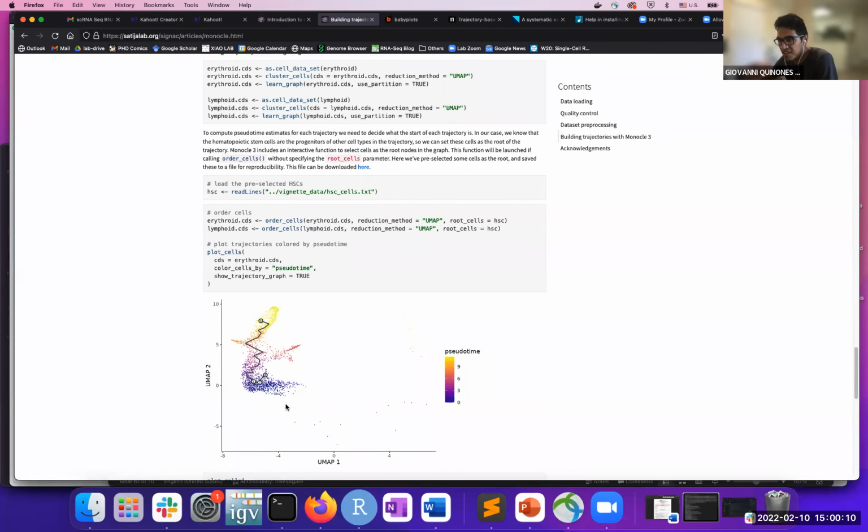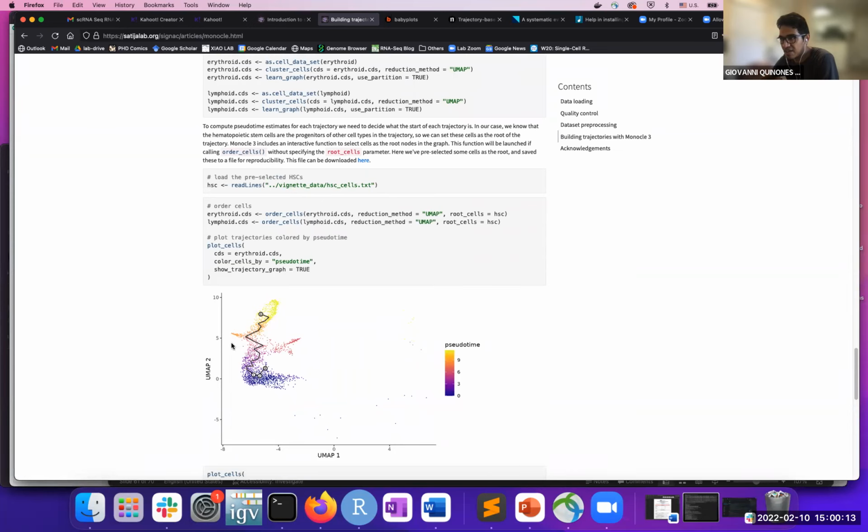In this plot over here, you can see that they're showing the representation in the UMAP. So in this 2-dimensional clustering, but the trajectory algorithm that was run on this data was able to come up with a 3rd set of coordinates, being the pseudo-time coordinates. And here in this example, the pseudo-time coordinates is shown by the different colors that are on our data points.